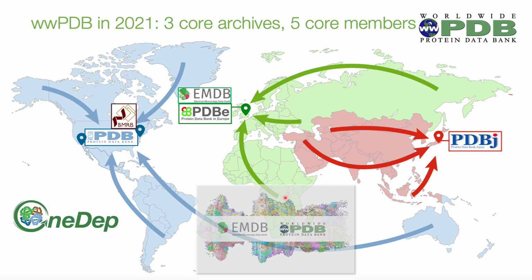Now, as of 2021, EMDB has joined the Worldwide Protein Data Bank. So this organization now manages 3 archives, the PDB, the BMRB, and EMDB, and it's made up of these five members.